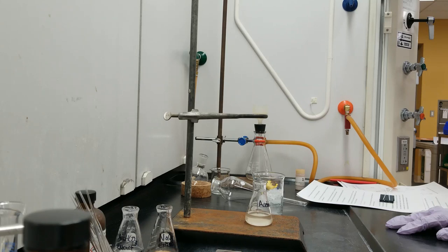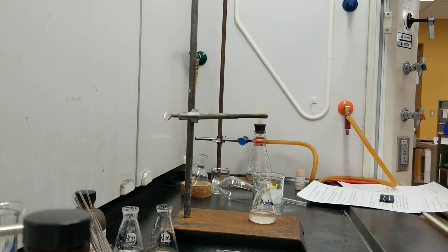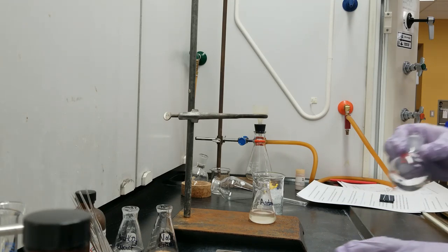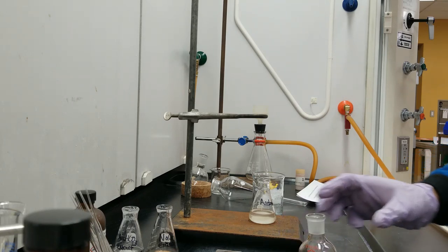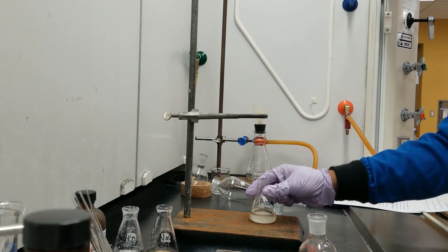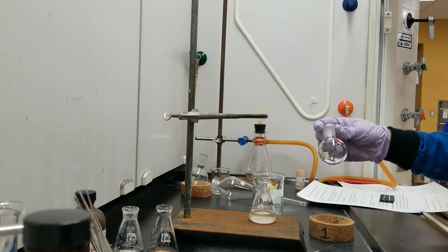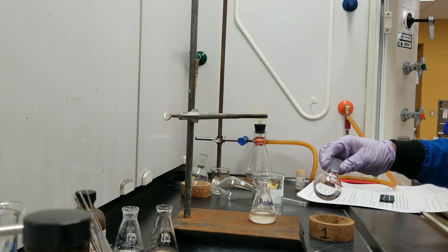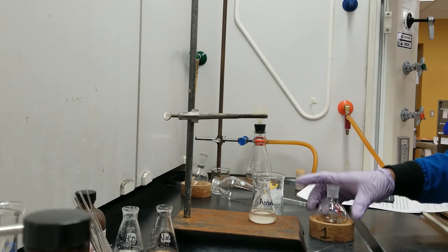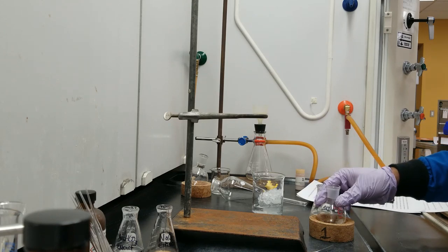For doing that, we will tare a 50 ml round bottom flask and transfer this liquid into the 50 ml round bottom flask. The weight of this guy is 43.01 gram. So this guy is the 50 ml round bottom flask. It weighs 43.01 gram. We will transfer this liquid into the round bottom flask.